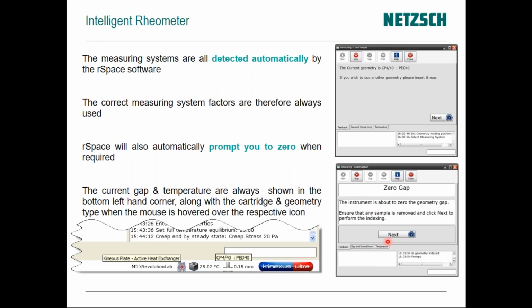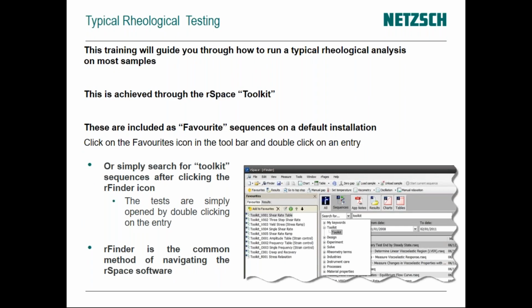Now the force of zeroing is actually 10 newtons, or about 1 kilogram. So if you put your hand underneath, it won't injure you. It might not be very comfortable, but it won't injure you or anything. We do recommend that you don't jam your hand in above the head or anything like that, because I don't think those things have got too much sensitivity, and it may be very, very painful to do that. It should be safe, but I don't think it's going to be very comfortable.